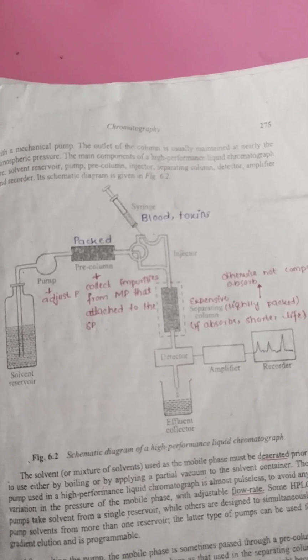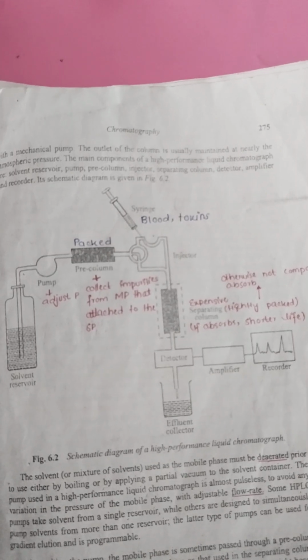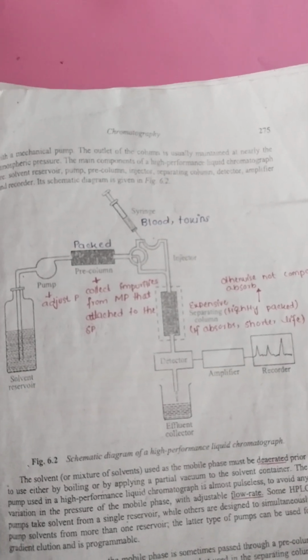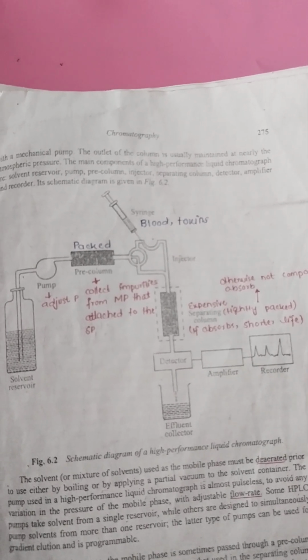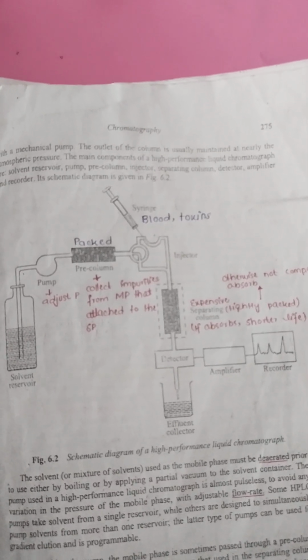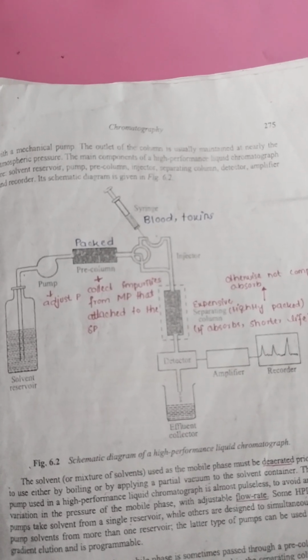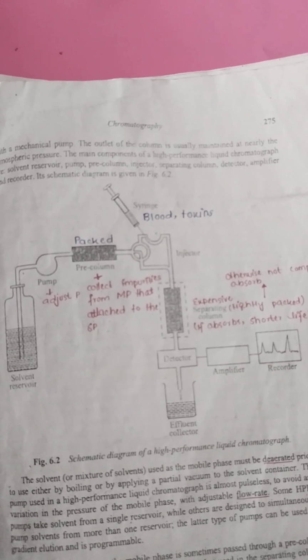Then there is the injector. Through the injector we inject our mixture. There are two positions of the injector. First is the direct position, where the mixture flows directly through the injector and comes to the separating column, and the other is the loop. In the loop, our mixture then goes through to the separating column.